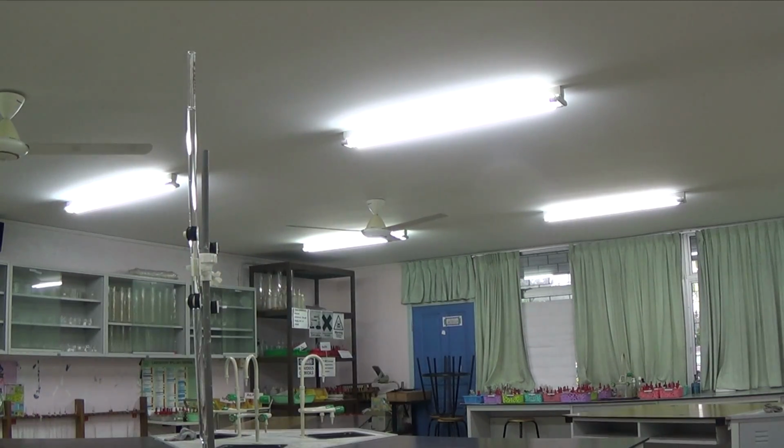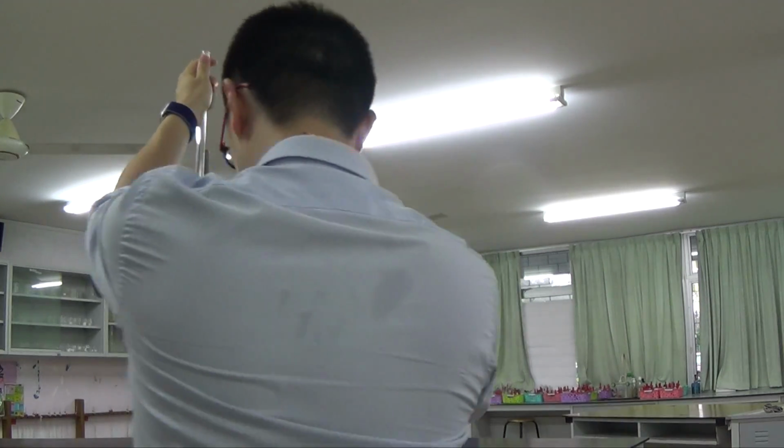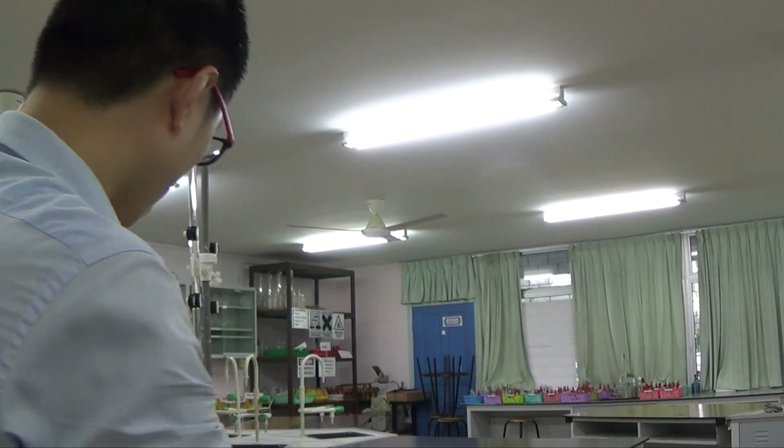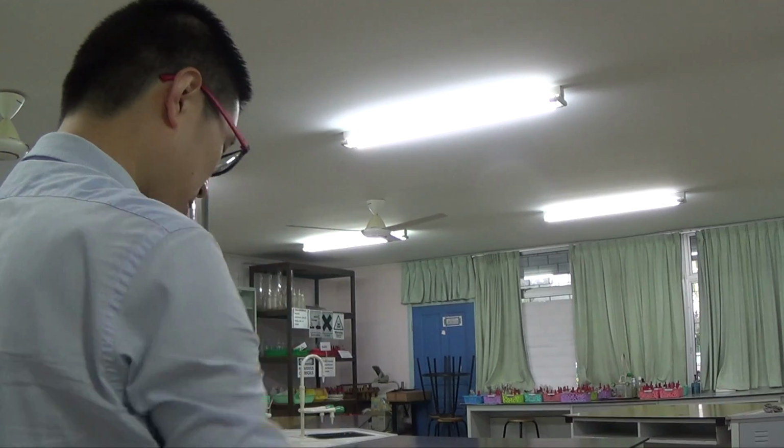Okay, just give me a minute. I just need to go grab a towel. I made a bit of a mess. My burette is a bit wet at the moment, so I do not want it to affect my reading or whatever later on. So I'll leave this be for the time being.